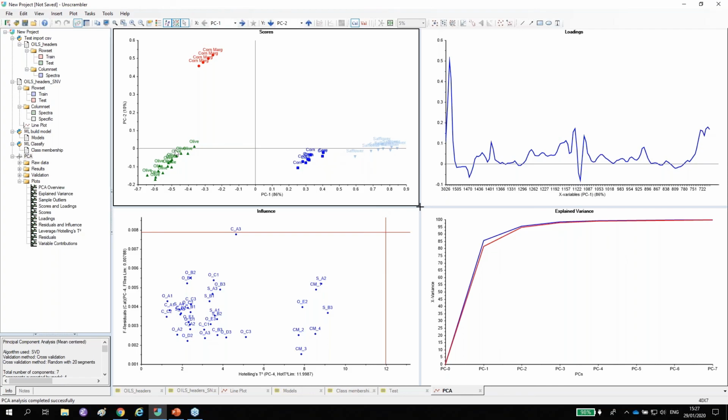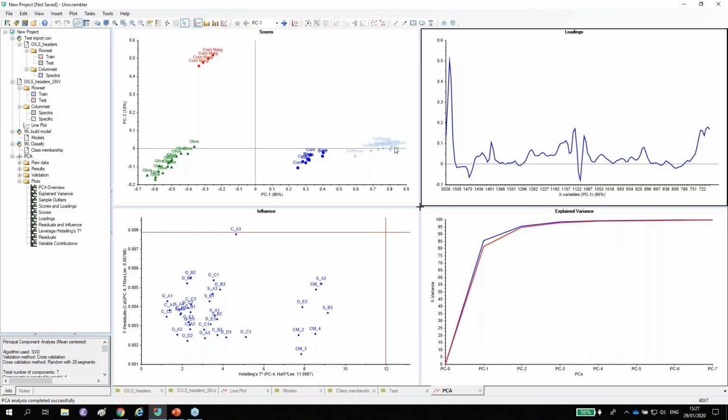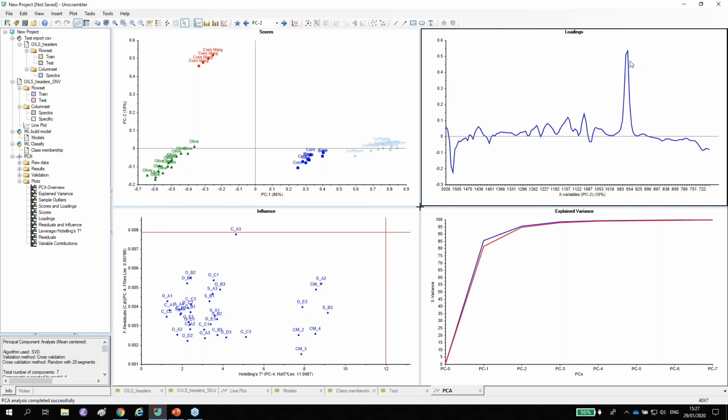So for the first axis here, which is a map of the different training samples, they are associated with high values in this peak here in the loading plot. And this peak is actually associated with unsaturatedness. So you can say that from left to right in the scores plot here, you actually increase the level of unsaturatedness, right? So what's the interpretation of principal component number 2?